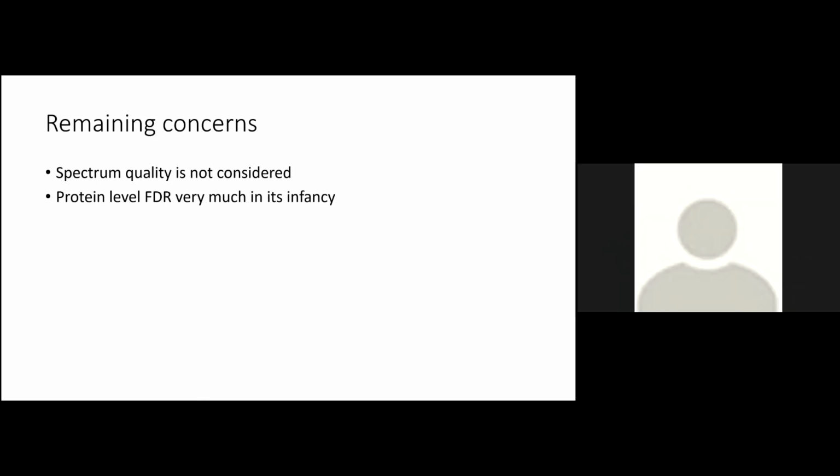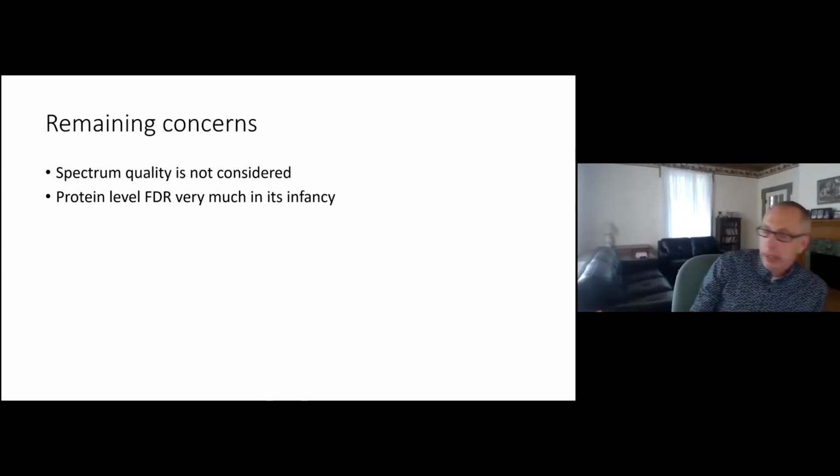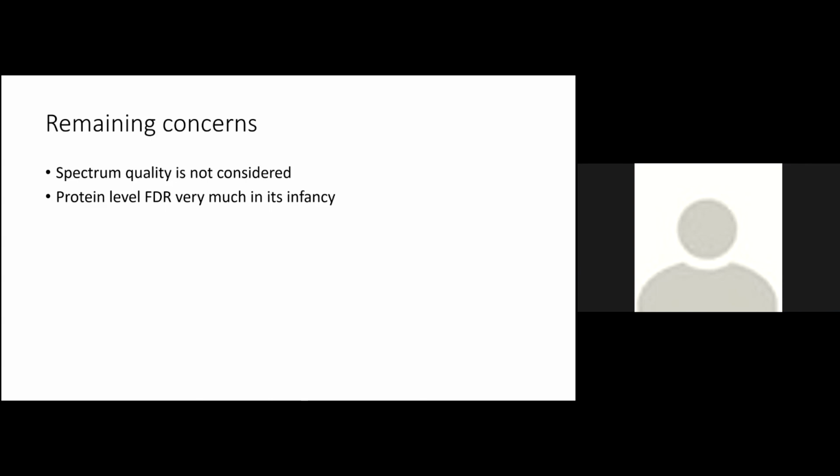Yeah, you know, I'm trying to figure out why I'm thinking this, but I see it as different when you go to the protein isoform level. So maybe that's a discussion, because I'd like to learn a little bit more about why you're comfortable with applying these approaches at the isoform level. I think with having a lot of peptides that are shared and very few unique peptides, I just wonder, from the statistical assumptions, if they hold or not. But yeah, I don't want to prolong the discussion, but maybe it's an opportunity to talk more about this later, have this as an agenda.